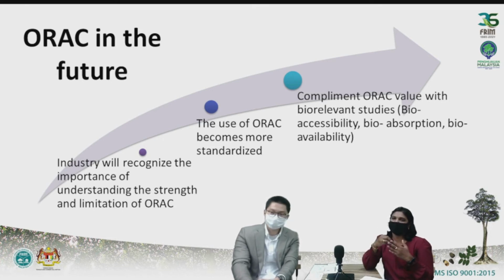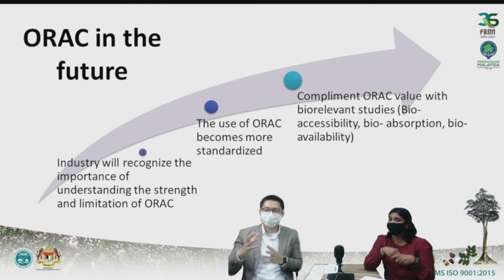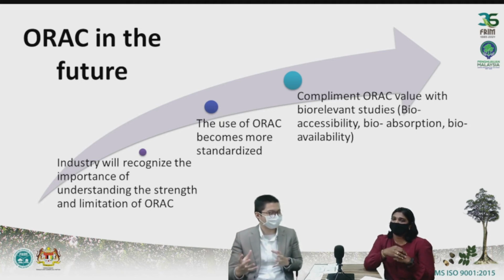And another thing is to complement the ORAC values with the biorelevant studies, for example, like the bioaccessibility, bioabsorption, and also bioavailability studies. So that's quite interesting. I think maybe you can expand a little bit about these biorelevant studies. What sort of assays are they? Are they like a different version of ORAC assays?